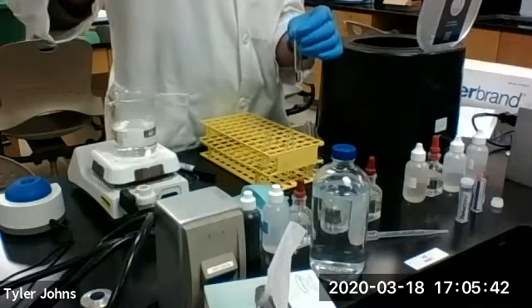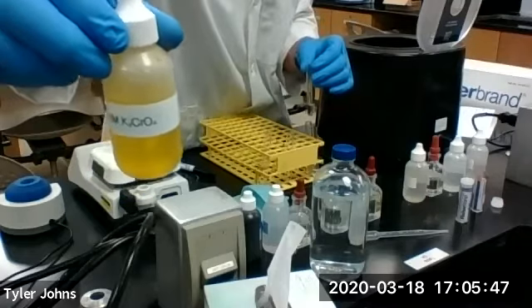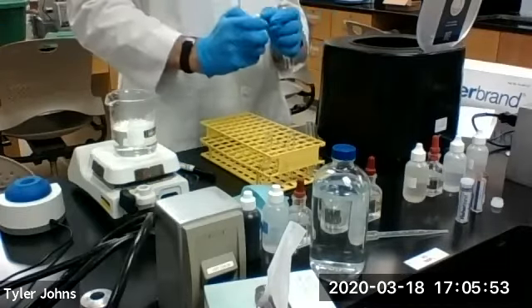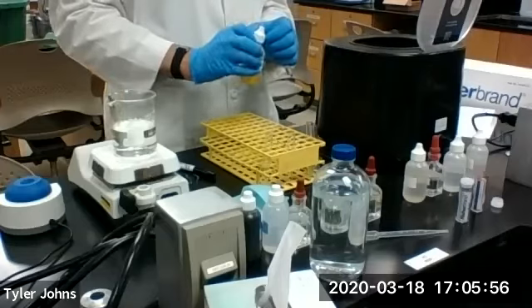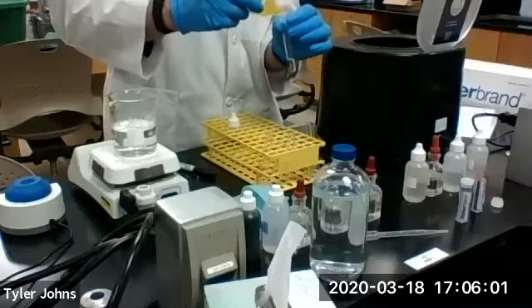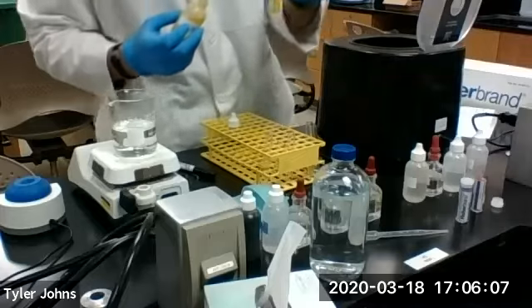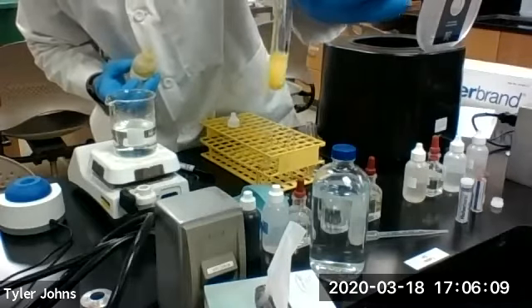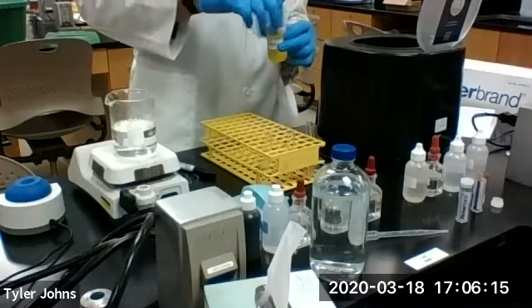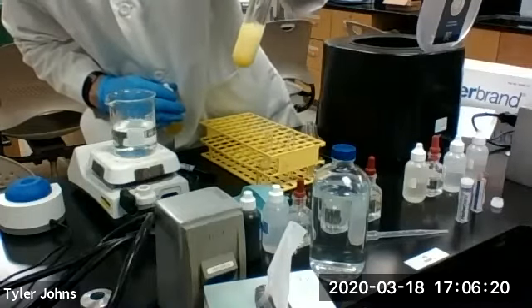Next, we're going to add 3 drops of 1 molar potassium chromate. Three drops of the 1 molar potassium chromate. As you can see, we're starting to get some yellow precipitate. That yellow precipitate is our barium chromate.